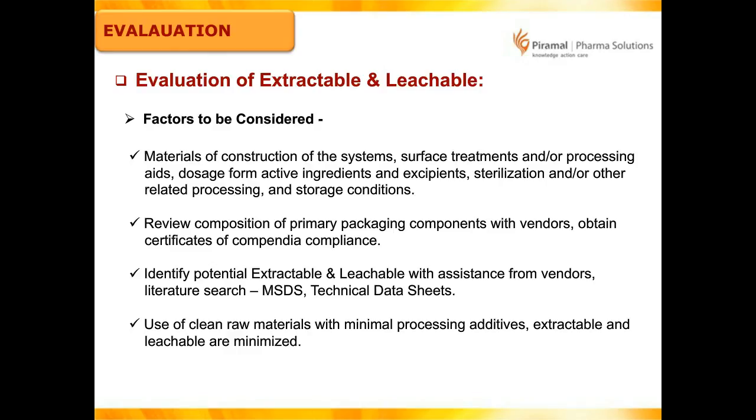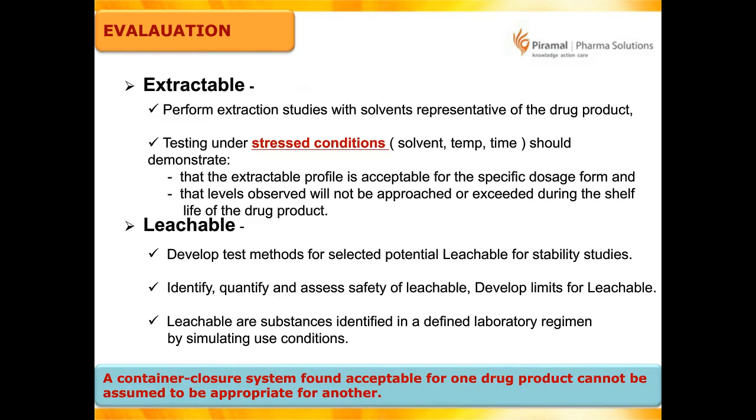So coming to slide 16, extractable studies with solvent representative of the drug product. Perform the extractable study with the solvent representative of the drug product. What does it mean? The same conversation I was having. Suppose your drug product is non-aqueous, and you have a few percentage of ethanol in your drug product. You need to perform the study with your rubber stopper in the presence of ethanol.